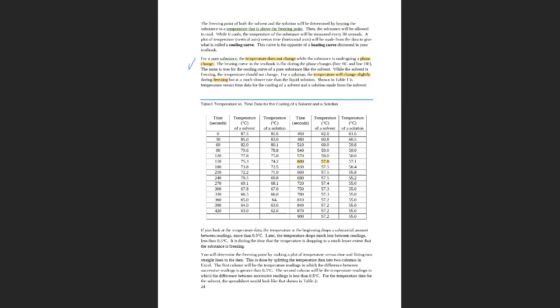Here it is explaining quickly how you are going to do it. The stearic acid is our solvent, and it freezes at about 69 Celsius. We are at about 25 degrees Celsius, so you have to heat the solvent to make it liquid.